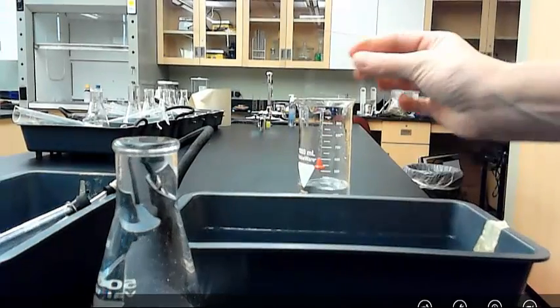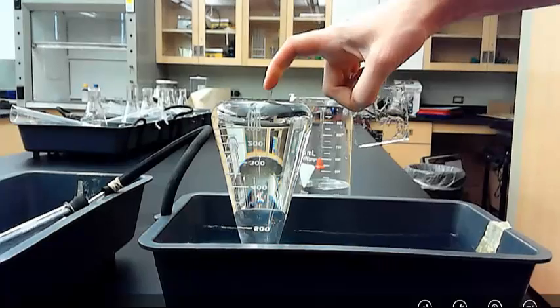So here's the key stuff that you need to be able to do. You're going to have a large Erlenmeyer flask. And your job is you're going to have to fill it all the way up with water. So you're going to fill it up to the tippy top with water. All the way up. And then you have a little glass plate. You're going to slide that glass plate over the top so that there's no air bubbles.